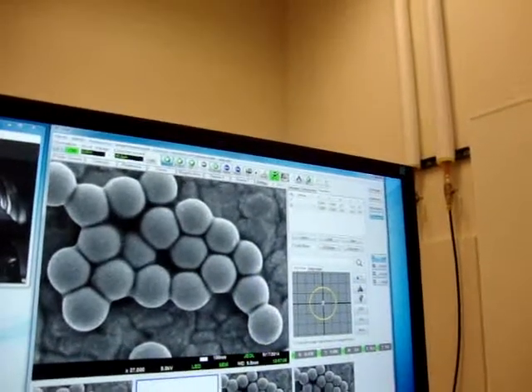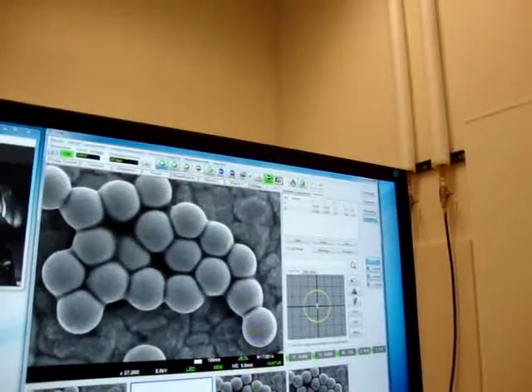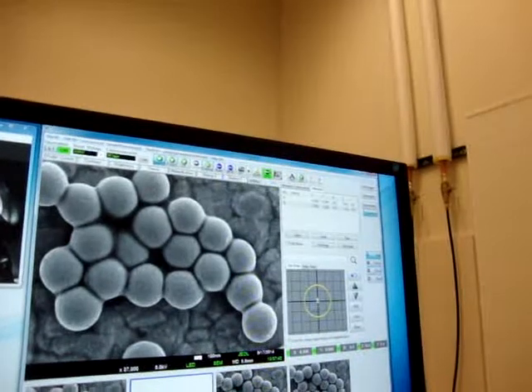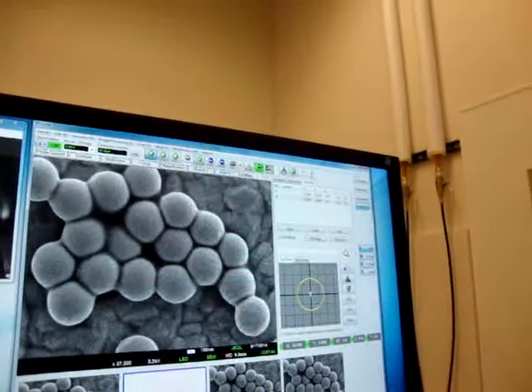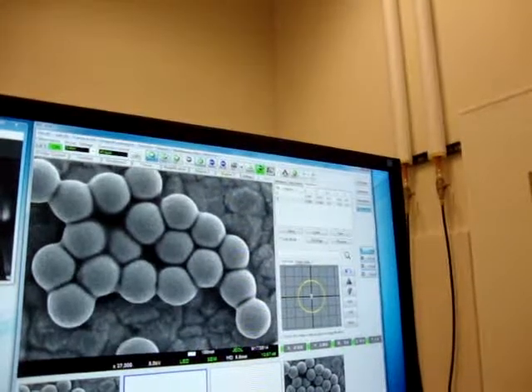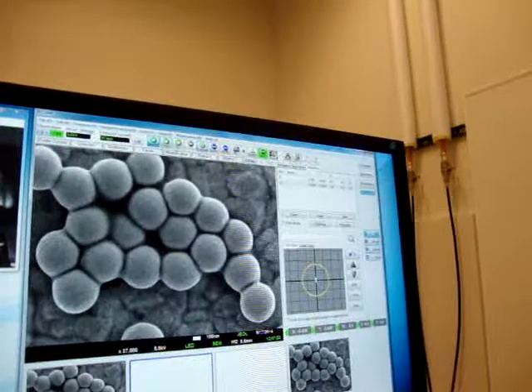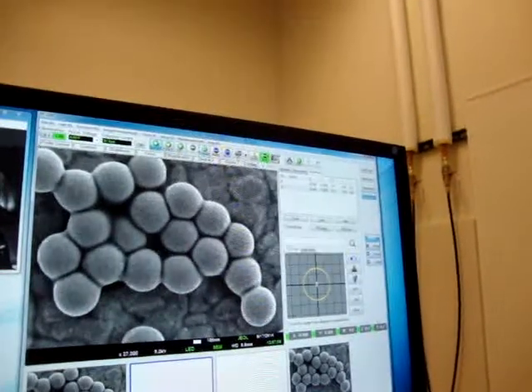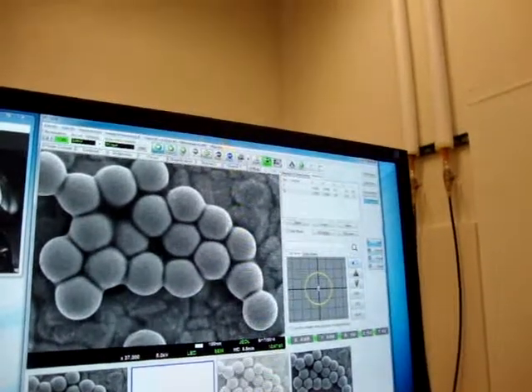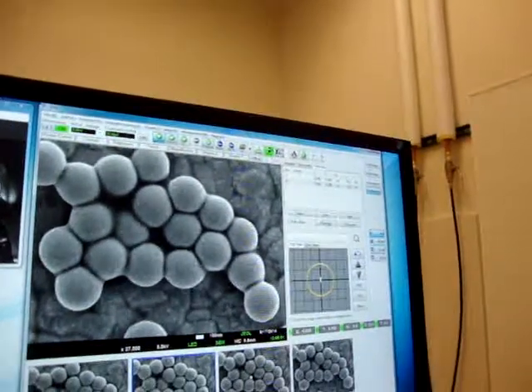Well, it's white completely, so I guess it's not. You're coming back. It doesn't look like BEDC. It's like you're making your image disappear. So these processings, you're putting them up in the center. It has to do with how you want the image processed. This way you get a chance to look at all your choices at one time.